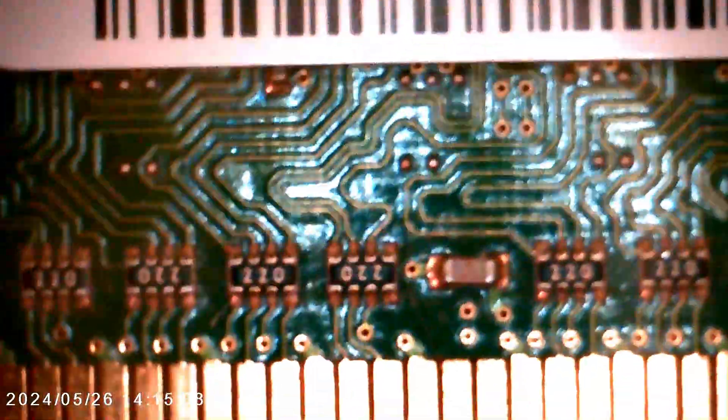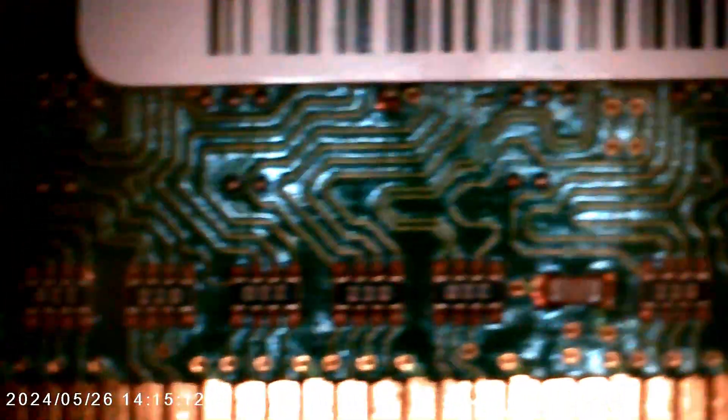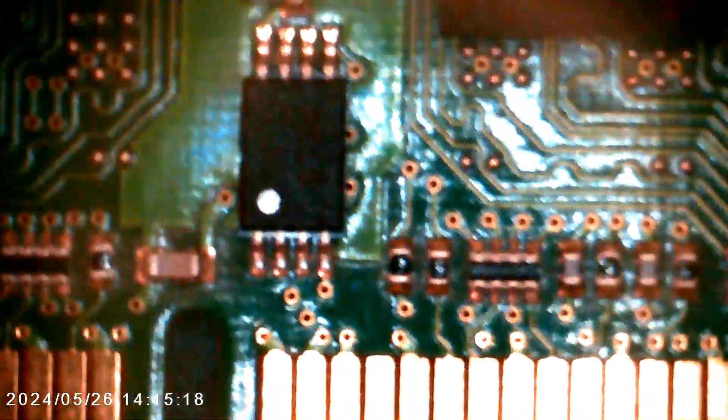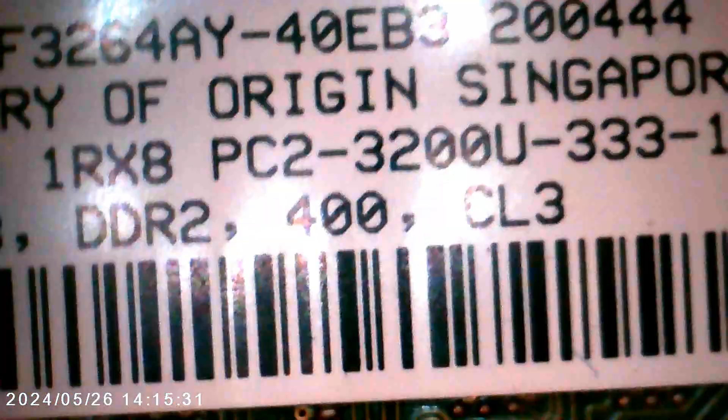And here is a stick of RAM. An old 256 megabyte DDR2 chip. You can clearly see all of the traces on the circuit board and the components as well as the connector edge. Right there. There's some of the chips that are on it. Other solder pads and label.